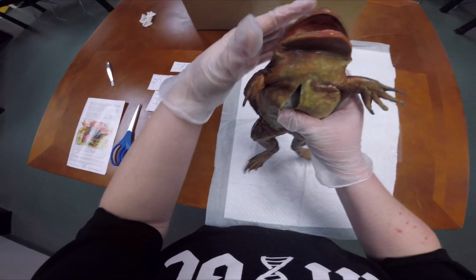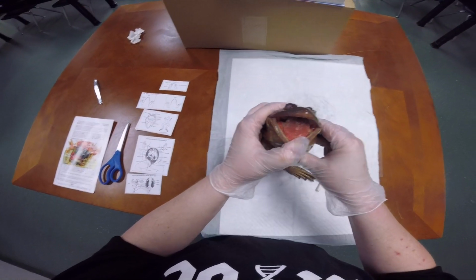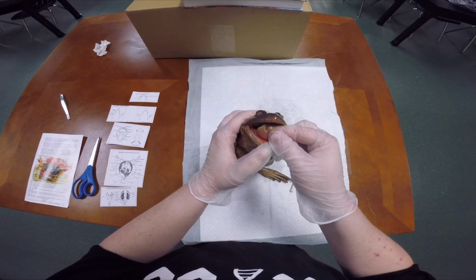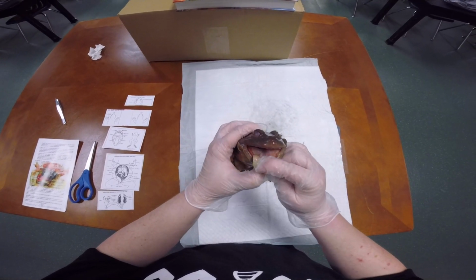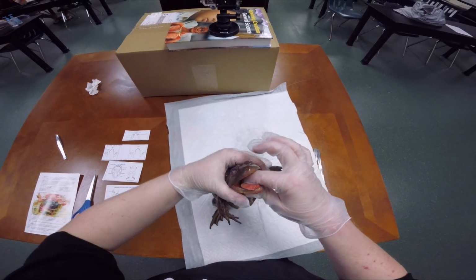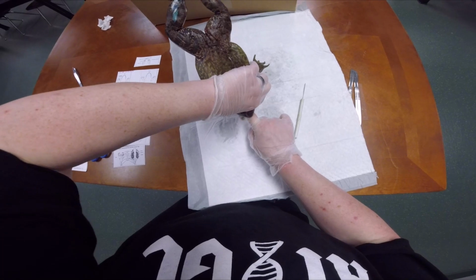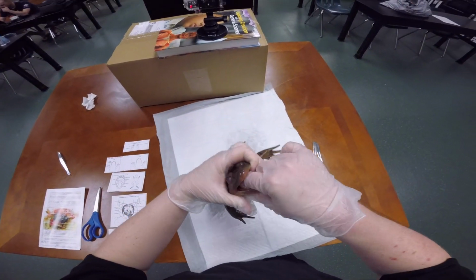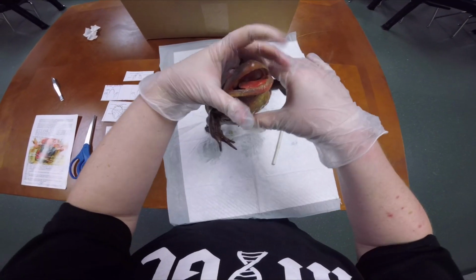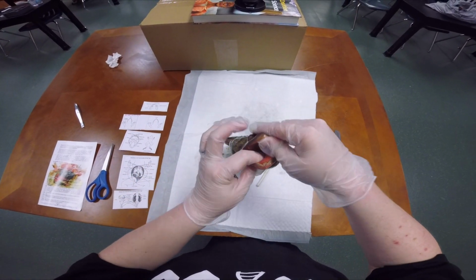So we can see in the mouth now, and the biggest thing you're going to notice is the tongue. This is the tongue right here, with that little sticky part that comes out to catch whatever he or she is going to be eating. I'm going to dump out that liquid so that we can look. All right, well, he's going to be a tough one.